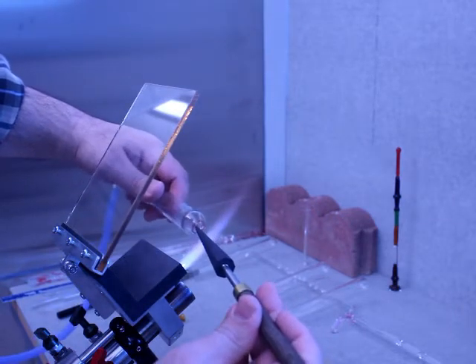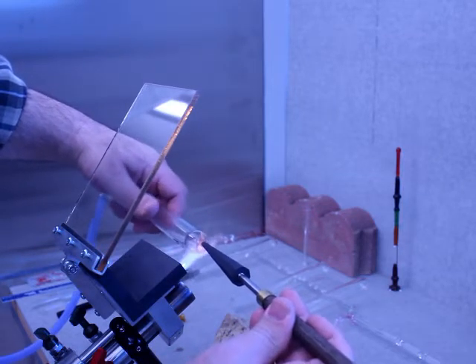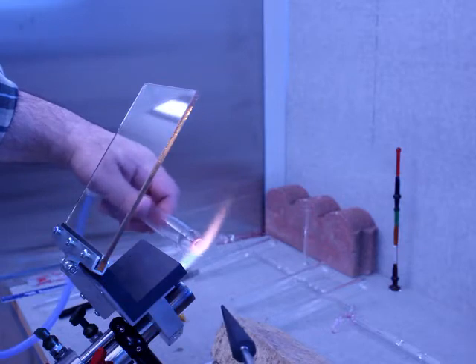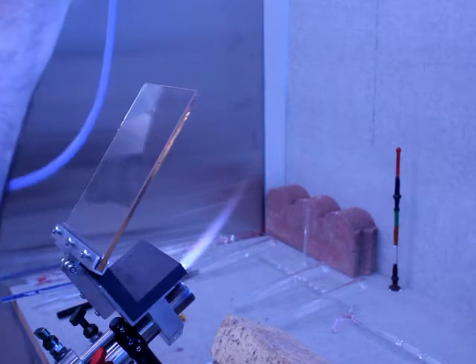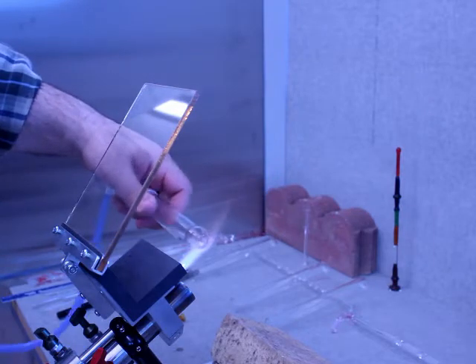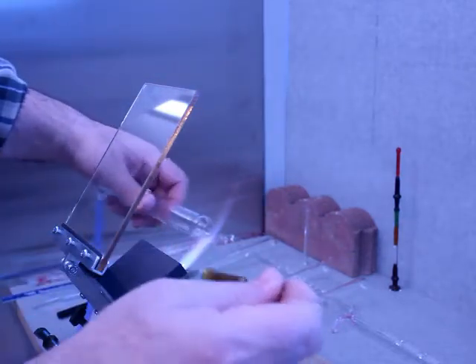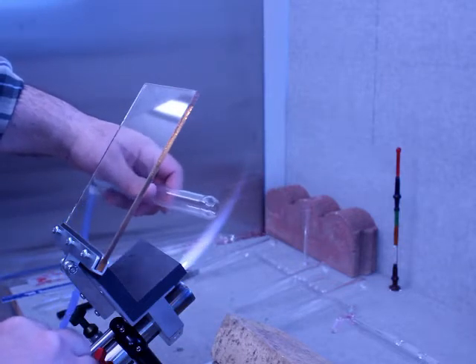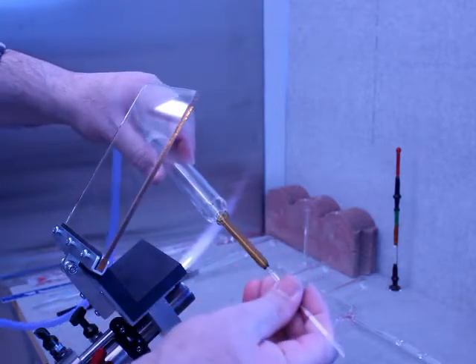Now that I've opened up this hole, I have to carefully go in with my reamer to flare it just a little bit. And this is, without a doubt, something that can be incredibly frustrating when you're first doing this, and I'm speaking from my own experience, because the hole is going to have a tendency to collapse on itself. It's going to have a tendency for the glass to kind of fold over onto itself. So if you don't get a very good opening when you pop the hole, many times it's best to just pull that section of glass off and try again. So now I've got my two sections.